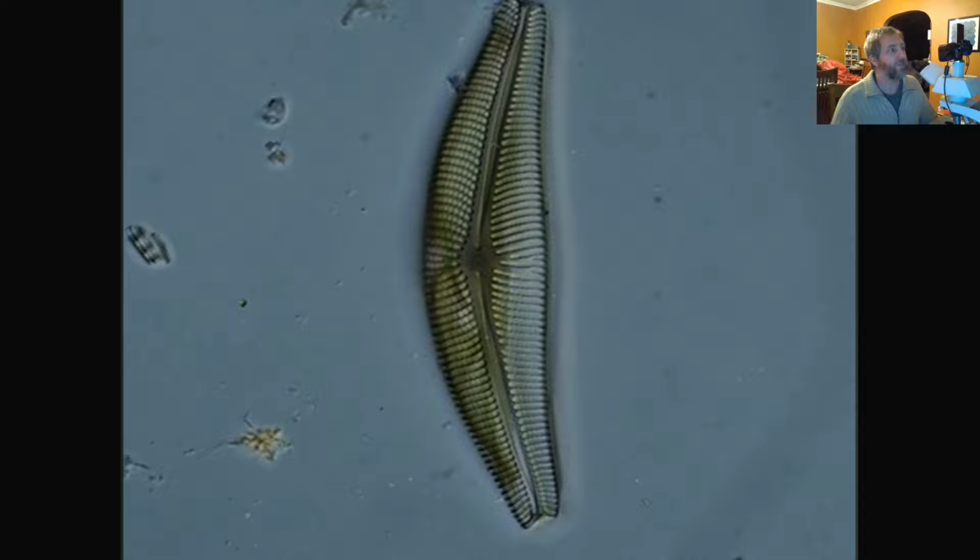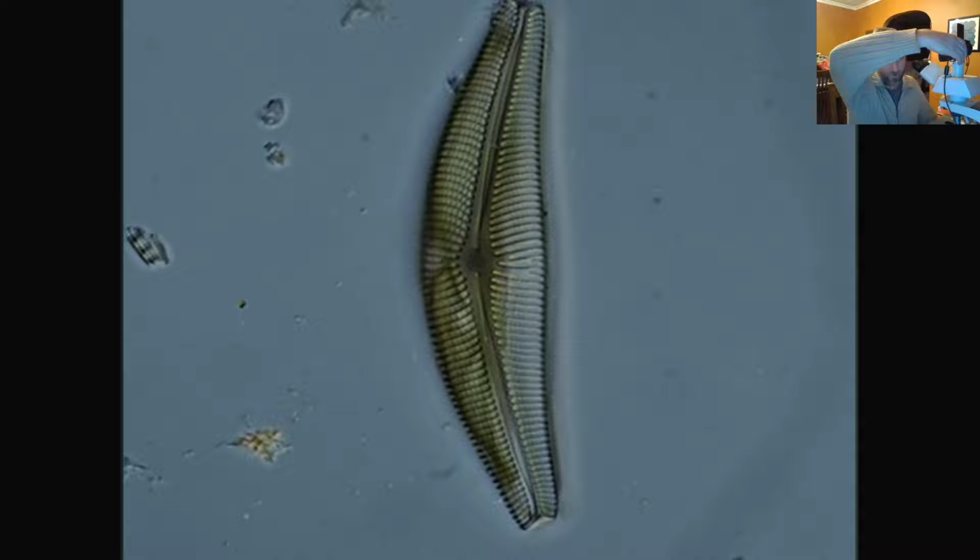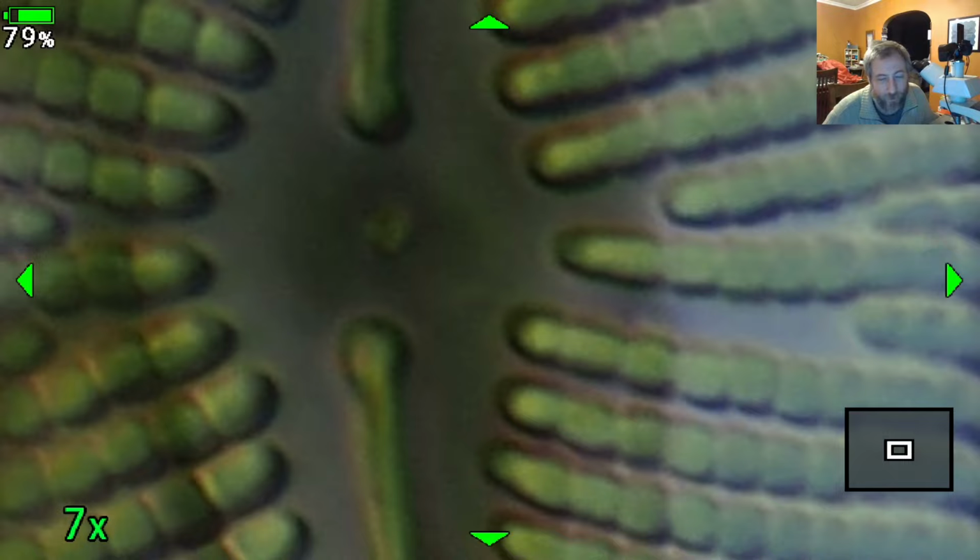You can tell because it has this... oh yeah, I can do this, I forgot. Zoomies? Let's zoom into that little area right there. You can tell because it has this... see how the striae look like little blocks? All the way through it, and right in the center, it's kind of hard to get it to stay still. There's a stigmoid right there in between the proximal ends of the raphe.